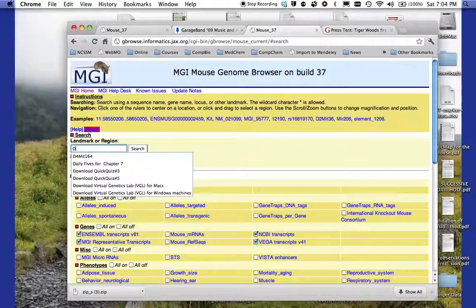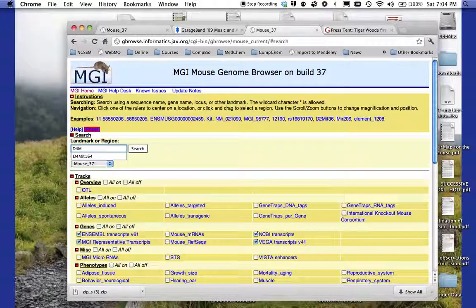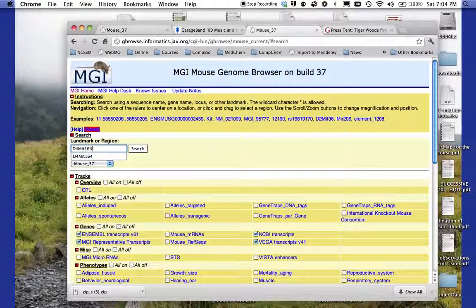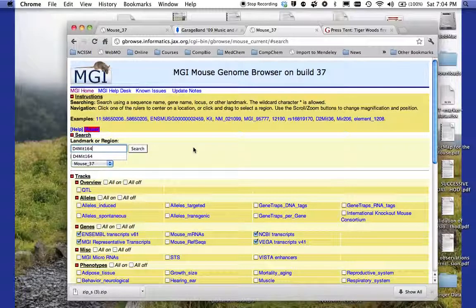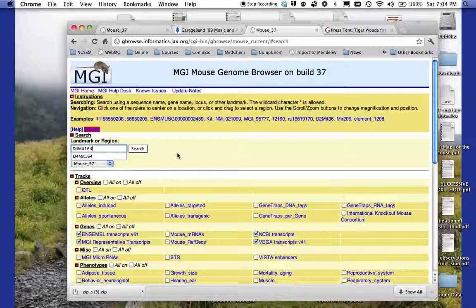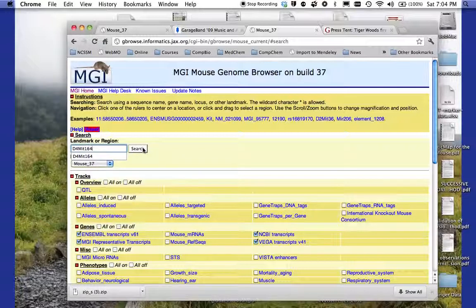We're going to look for D4MIT164 because this is a marker that came up during a QTL analysis. So I'm going to type in D4MIT164. I'm going to hit the search button.